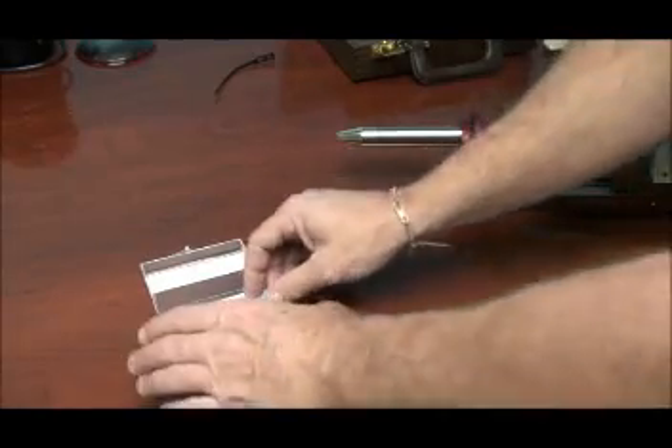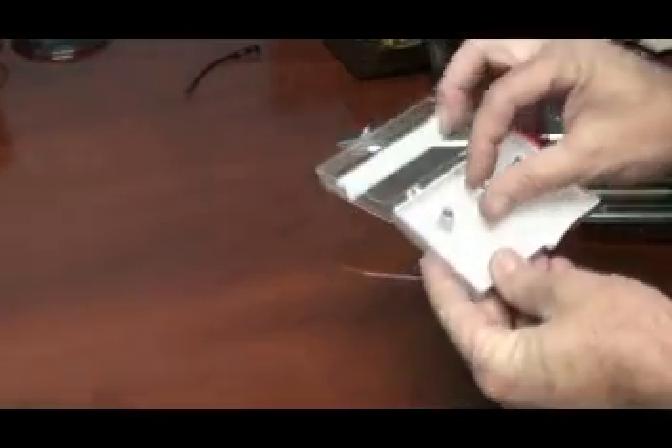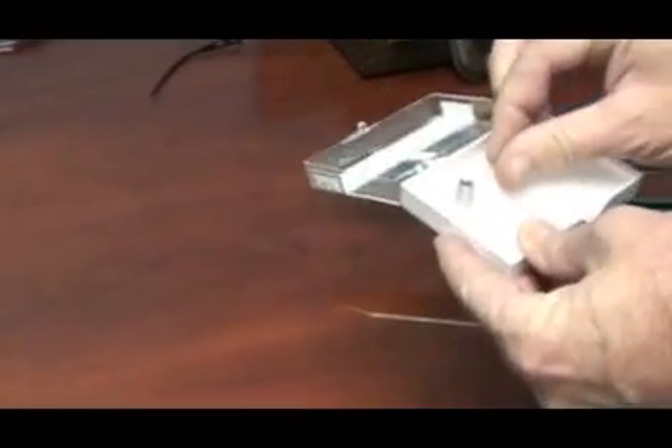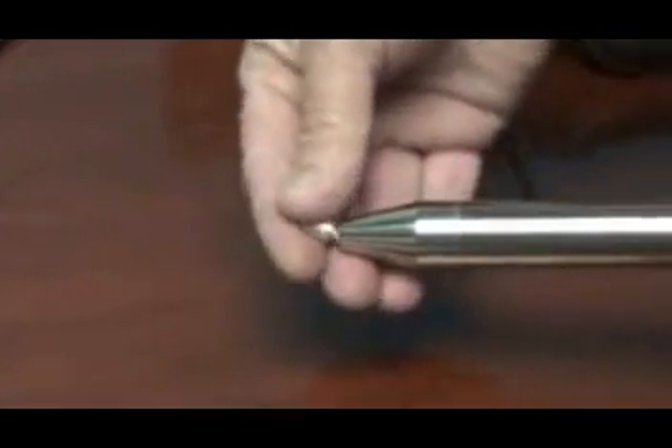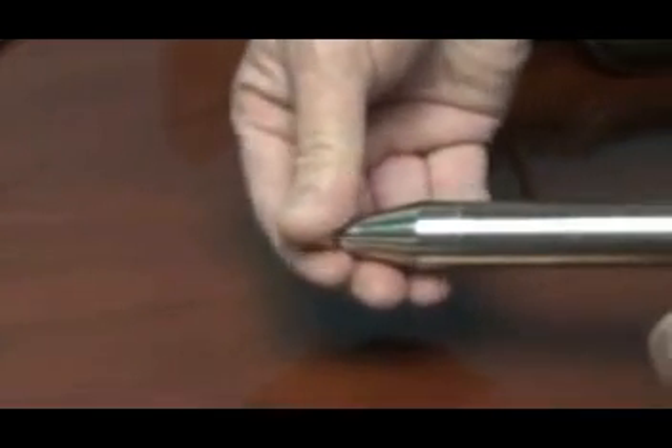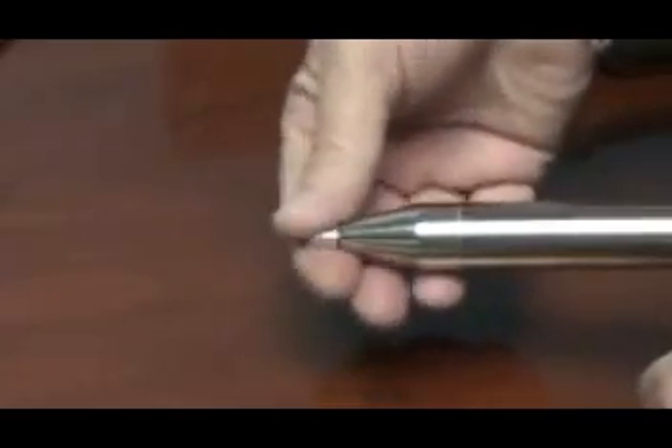Each FX SIM tube has a set of fabricated custom collimators, which are available for spot size adjustment from several millimeters down to 200 microns. Collimators are interchangeable and may be applied by screwing on to the end of the FX SIM tube.